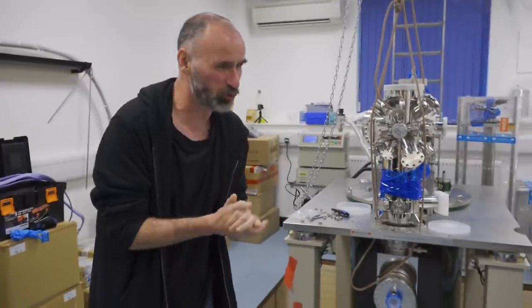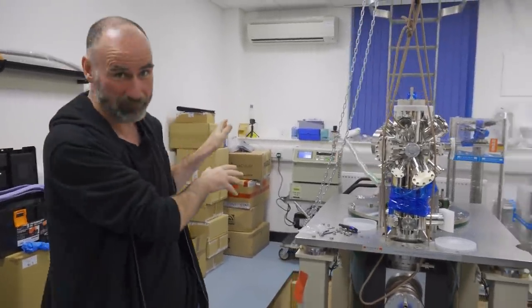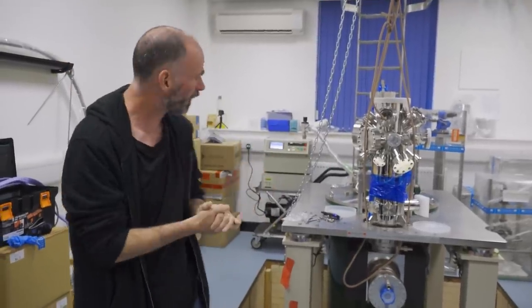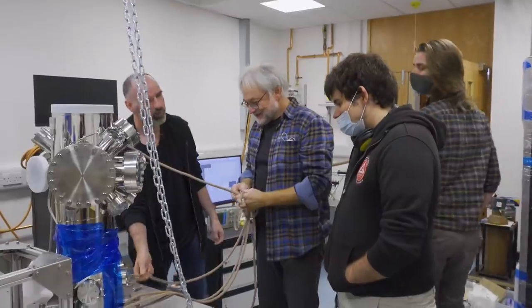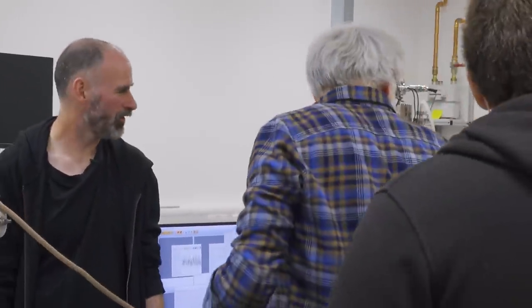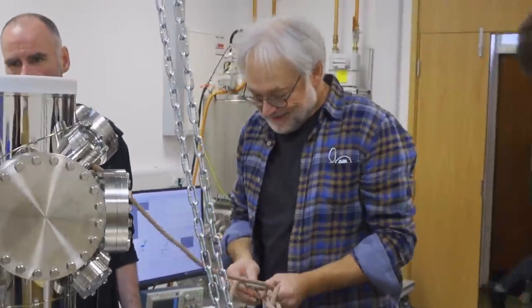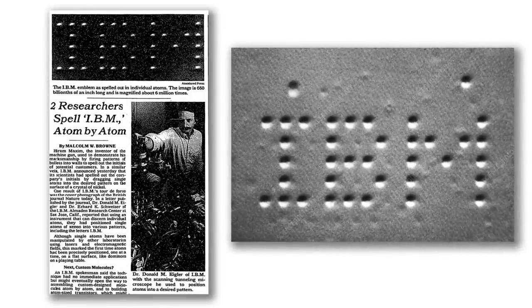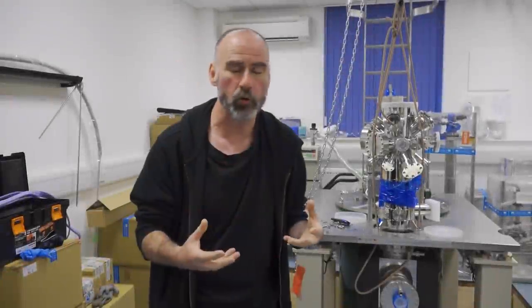It's just wonderful. The other great thing about it is we're standing back and watching the guy who's like a master magician in terms of assembling this, a guy called Thomas Berghaus. Thomas did his PhD right at the start, at the origin of STM, and the group he was in was one of the groups that was quickest to follow on from the IBM invention of the scanning tunneling microscope and pick up that technology and build their own STM.